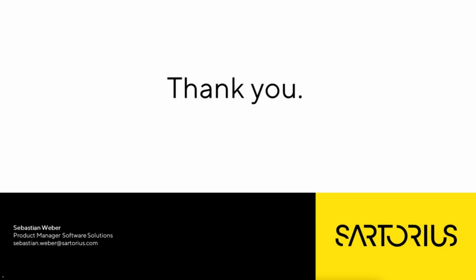Okay, so basically the results that are saved use a process called alibi data. Every time we generate data, there is a copy of the data on the balance, which is the alibi data. But we don't store other results on the balance. We basically give you a preview of your results, and then you decide what to do with it.